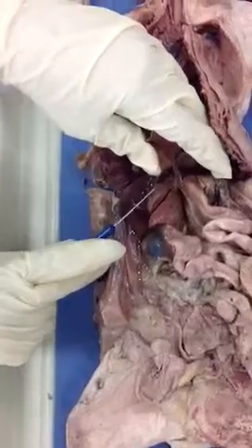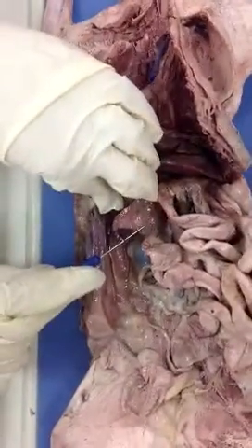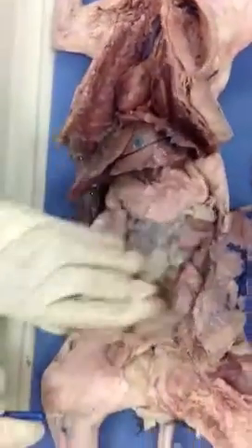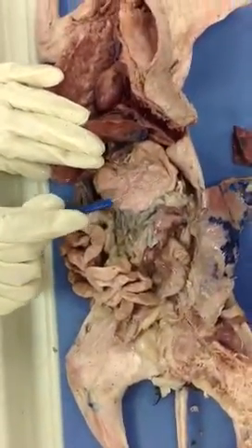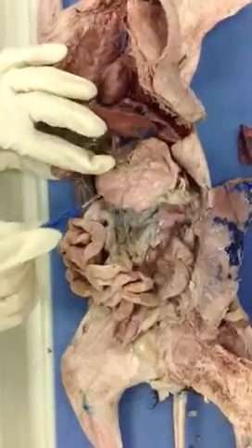This lobe, please. Right lateral. And then this one? Caudate. Very good. Now, I encountered this organ. What is the name of this organ? Stomach. Well, let's go over the parts of it.